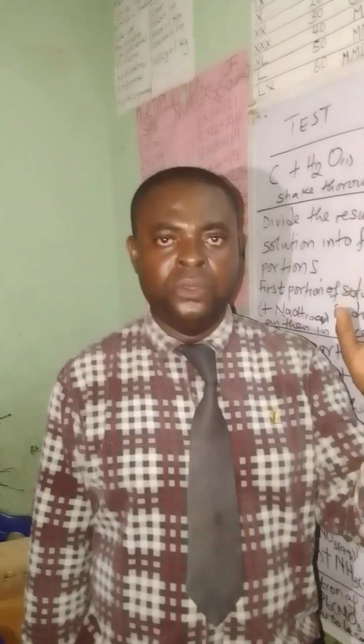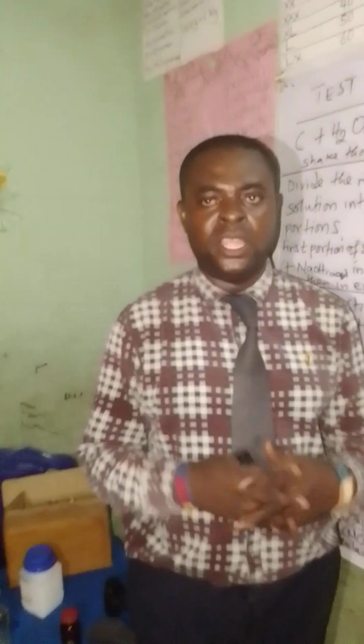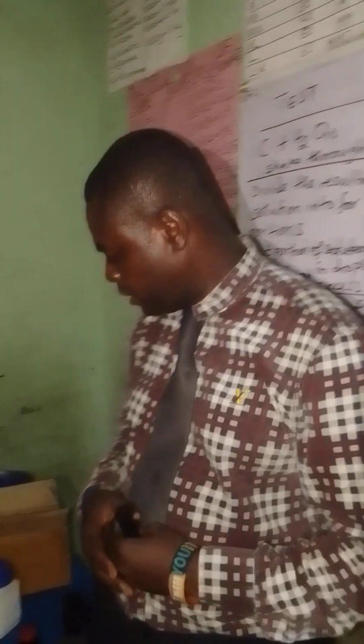With reference to the previous video, where I created a background understanding of question number 2 of the 2024 NECO chemistry practicals, we want to look at the practicality of what we spoke about. If you have not watched that video, please go and watch it. It's already posted.